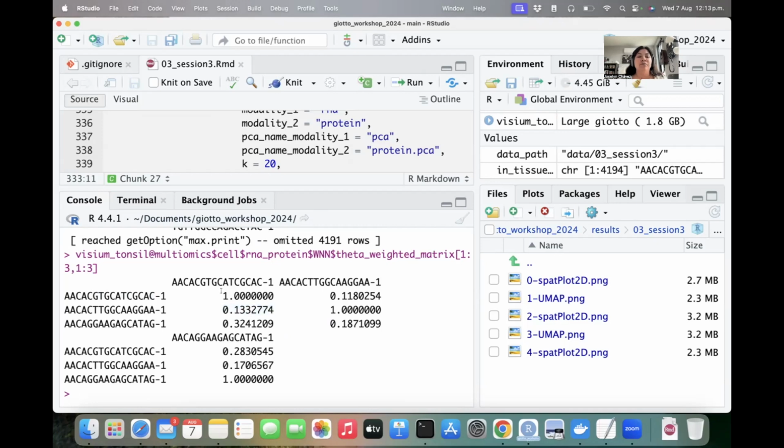So I believe this must be a different measurement. I'm not giving the right explanation here, because if you compare one cell to the other one, you have a similarity of 1. So I think it's showing how similar they are between each cell.